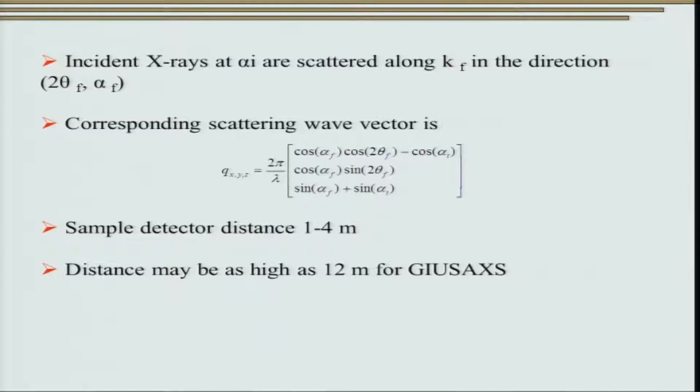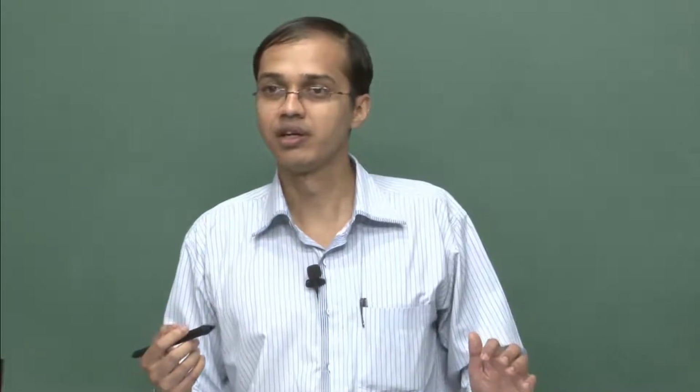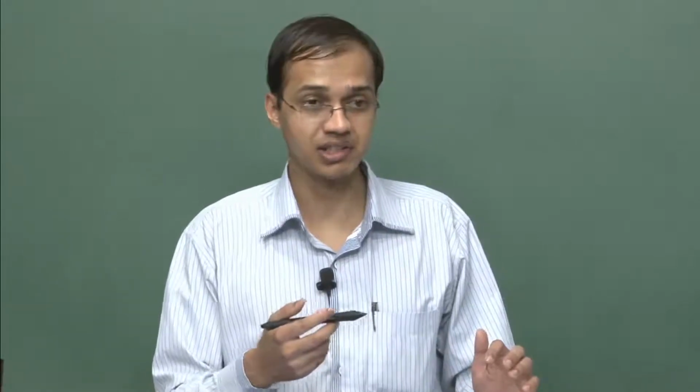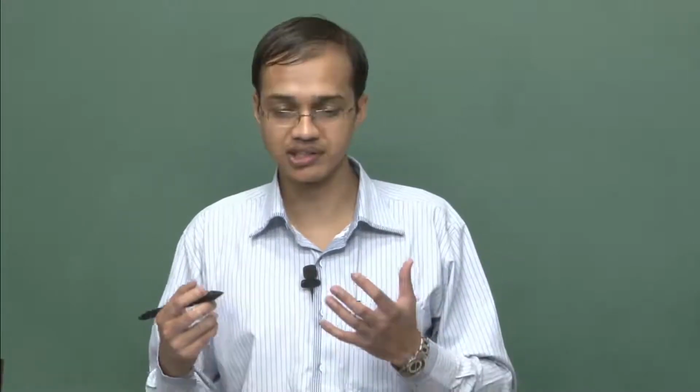Okay, so let us now try to touch upon the physics of grazing incidence small angle X-ray scattering. It is a pretty involved subject, and I am not going to touch upon all the details of the scattering or diffraction theory associated with it. What we are going to try to do is just get a feel for things, and see how the knowledge we gained while deriving the structure factor for normal diffraction, as well as the form factors in the last class, can be extended to understand how grazing incidence small angle X-ray scattering works.